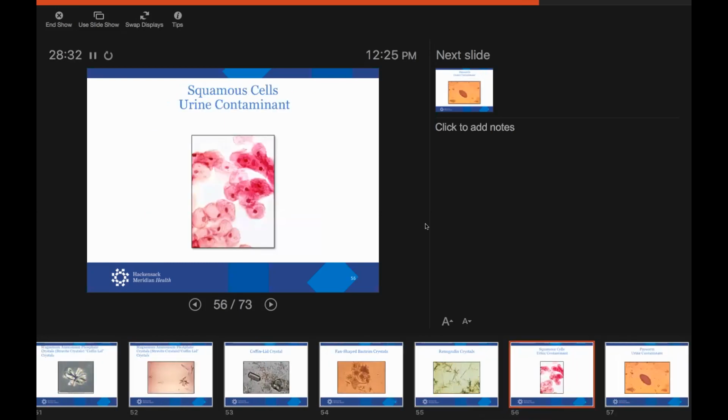All right, and this is garbage, squamous cells. So whenever you see squamous epithelial cells on a urine specimen, okay, that means that it's a contaminant, because men should not have squamous epithelial cells in their urine. Okay, that's why men's urine is a lot easier to look at than women's urine. I hate women's urine in the office because they were always giving me vaginal contaminant. Okay, so you have squamous epithelial cells in the urine, and then you can't interpret the urine analysis.